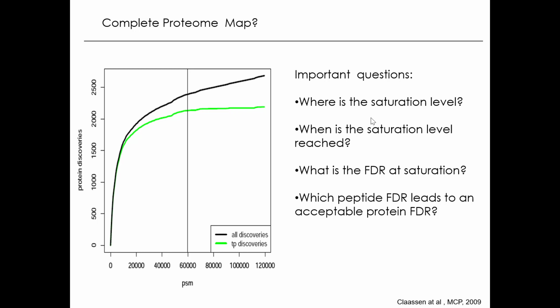So the problem of large data sets, or one problem we have to always watch for, is that if we keep adding data to a data set, when we extend the matrix on the sample side, we should always check whether the curve of proteins identified, whether it's in the DDA world or DIA world, doesn't matter, keeps creeping up or whether it stabilizes. If it keeps creeping up, there is almost certainly some problem with controlling the false discovery rate.